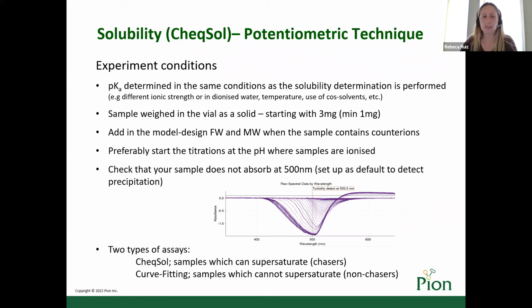Checksol has two types of assays: the Checksol for samples that can supersaturate, or chasers, and curve-fitted for samples which cannot supersaturate, or non-chasers.